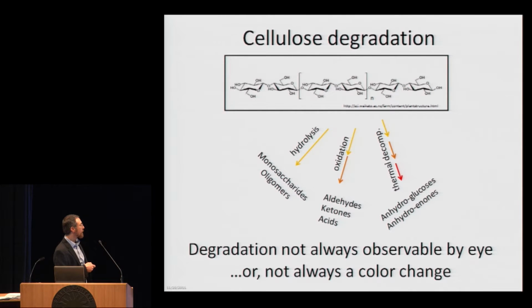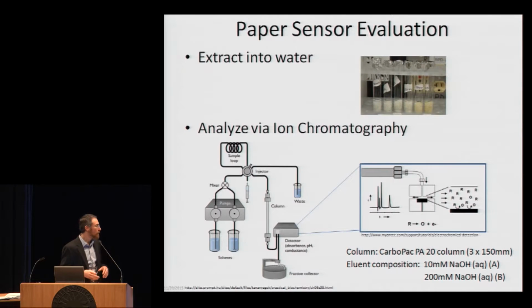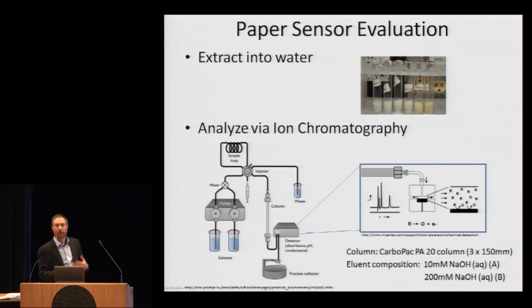And you can take a lot of these oxygens and oxidize them, break the chain open through various mechanisms and make aldehydes, ketones, and acids. You can really do a lot worse, which we will hopefully never get to that regime where we're basically burning the compound. But the problem with this test, unlike the Oddy test, is we can't visibly often observe those degradation changes unless the paper starts to yellow. We do see some of that, but if we relied on yellowing, even if we use scientific instruments to view it, we'd be missing a whole boatload of information.